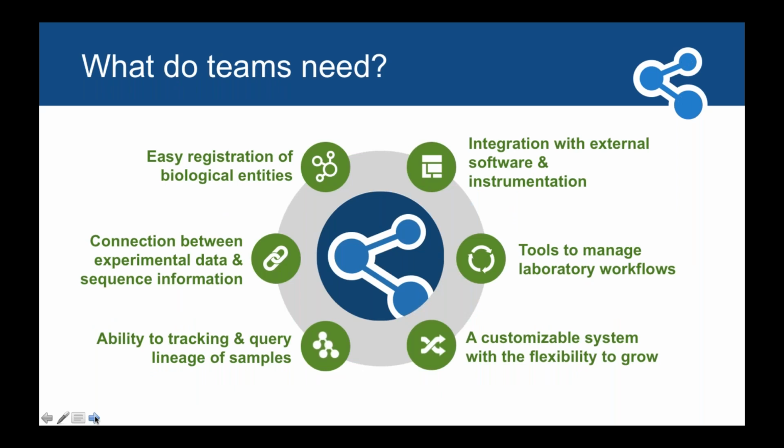As we worked with Just Bio, as well as a number of other companies, the question is, what do molecular biology teams need? What do we need to do to enable this team-based science? So the first piece of that, and foundationally, is easy registration of biological entities. And I'll show you how we do that within the system, but the key thing to remember is that the entities themselves are fairly configurable. So we've got protein sequences, nucleotide sequences, cell lines, constructs, etc. And we always provide a number of different ways to actually register the entities.